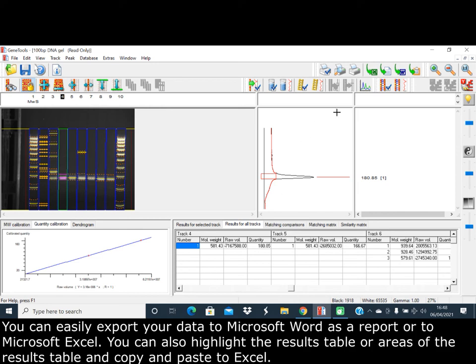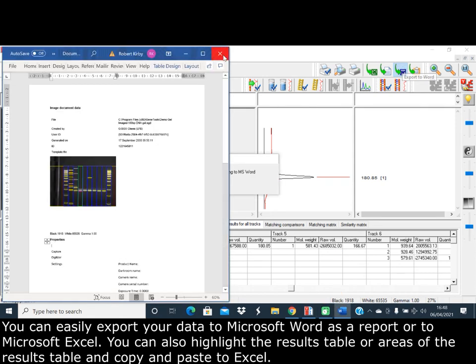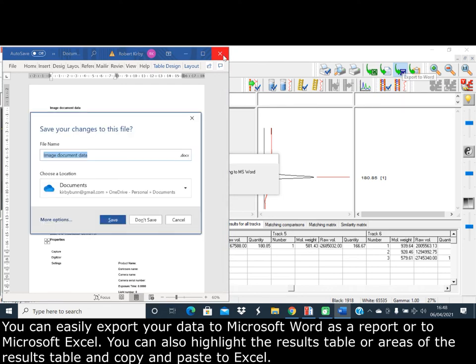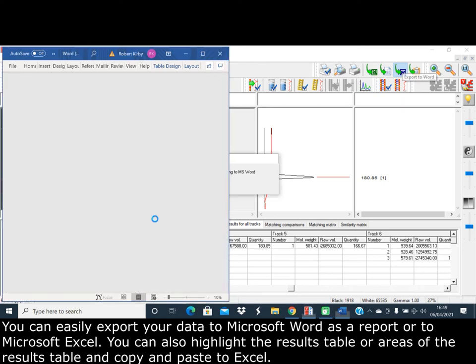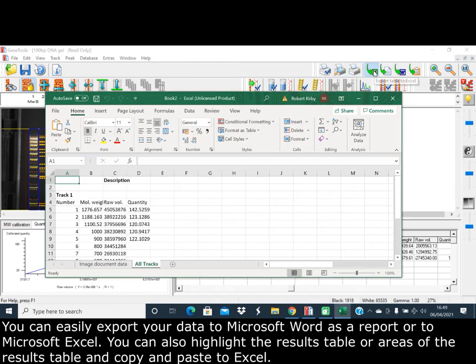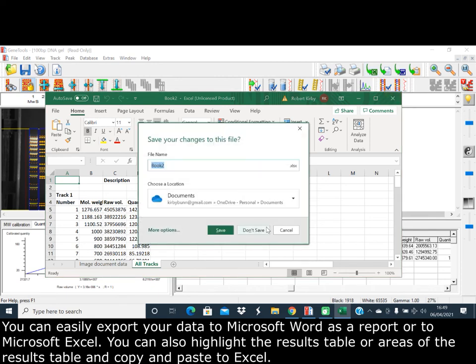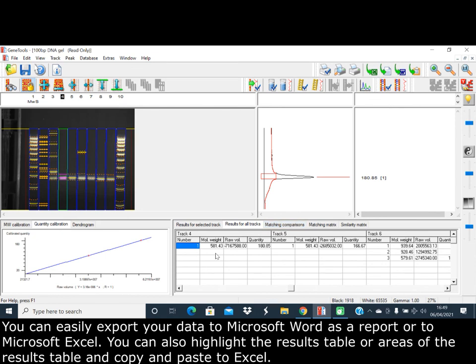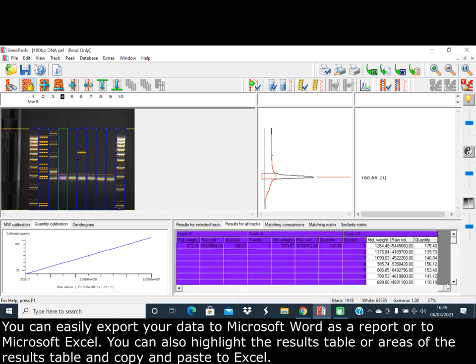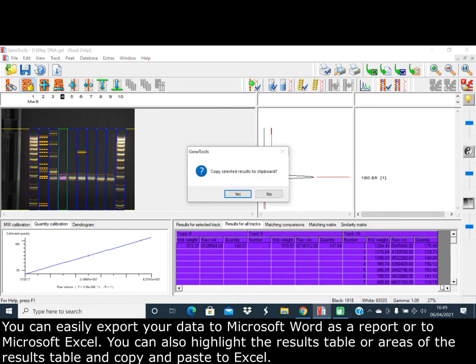You can easily export your data to Microsoft Word as a report or to Microsoft Excel using the export function. You can also highlight the results table or parts of the results table and copy and paste to Excel.